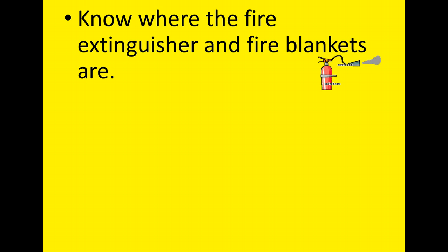Make sure that you never touch the fire extinguisher. That is actually for the teachers to use. We've been properly trained in how to use them, so always go and get a teacher if there's a need for using that. The fire blanket is used if someone catches on fire, or we want to quickly put a fire out, then we would throw the blanket on there.